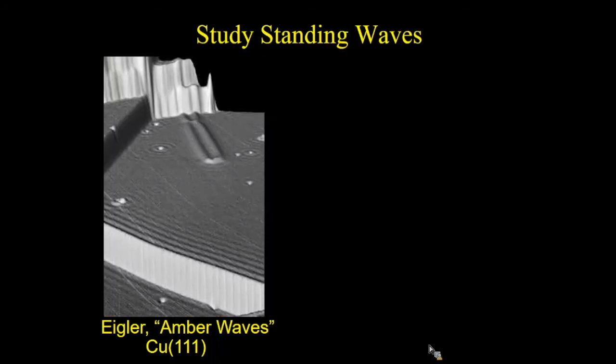If we zoom in on the step edge here, you again see those waves reflecting off of the step edge, as I showed earlier. What that comes from is you have some incoming k vector, you have some outgoing k vector, and the wave vector that you get out is just the difference of the incoming and the outgoing. And then that's 2 pi over that wavelength that you end up observing in the image.